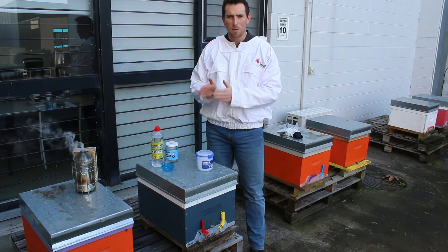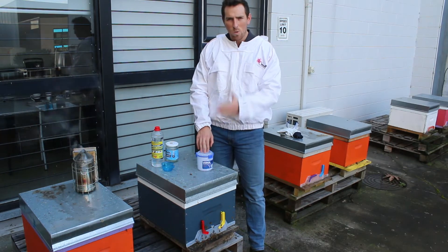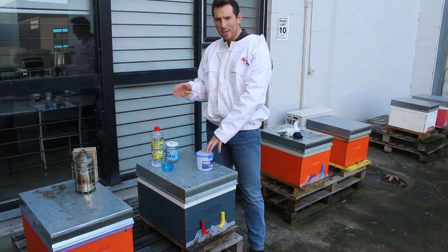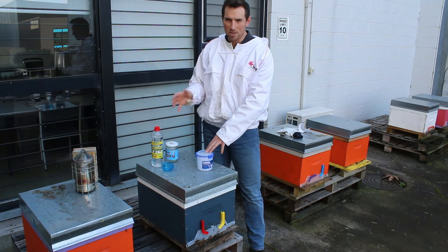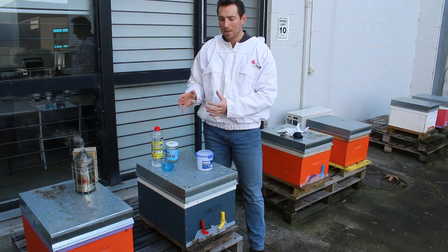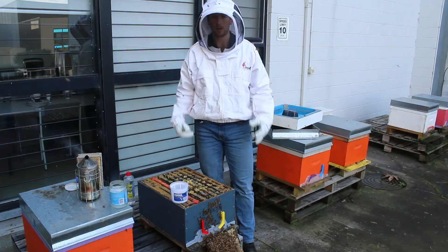When you want to use this, you want to use it to measure your mite count at the beginning of your strips and at the end of your strip application or varroa control application. That way, when you put your strips in, you know how many mites your hive or average apiary has, and then at the end of the application — say eight weeks down the track — you know how successful your varroa strip application was. That way you can accurately analyze your varroa count within your hive for your specific period of time.